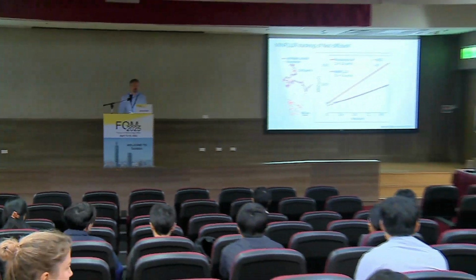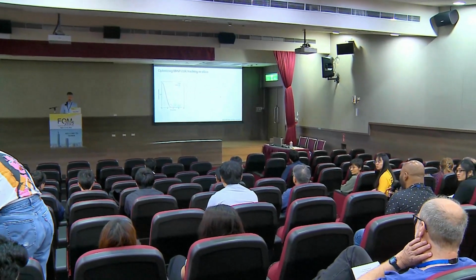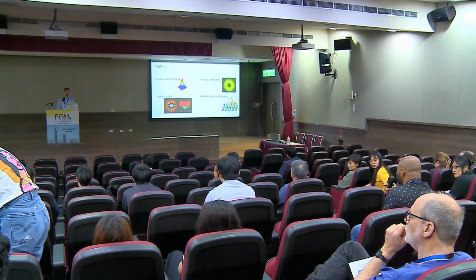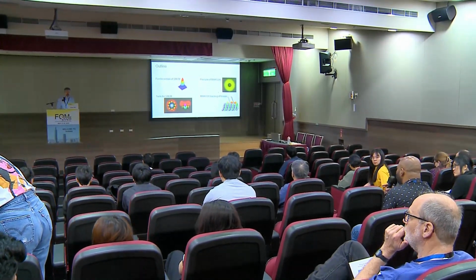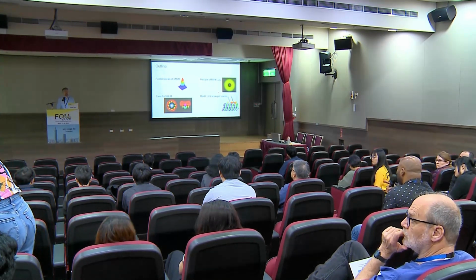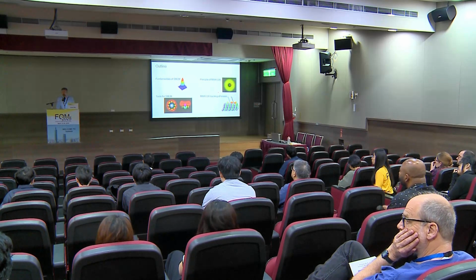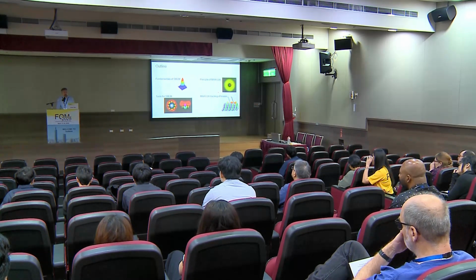So you mentioned the commercial MINFLUX instrument being a little bit slow, and it obviously affects applications like tracking. Can you comment on strategies that could be employed to speed that up? Perhaps fewer positions of measurements in the initial. So I don't think it's especially slow. I think most commercial systems have similar time scales.